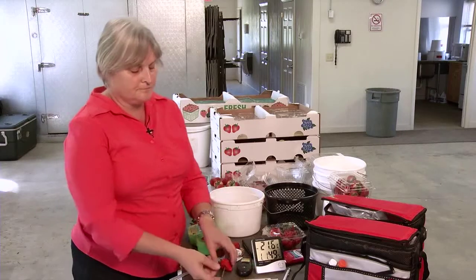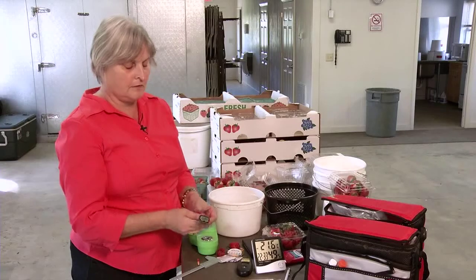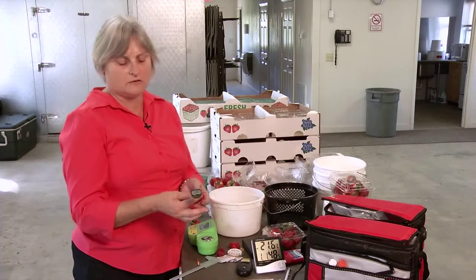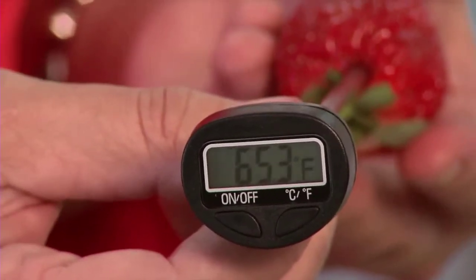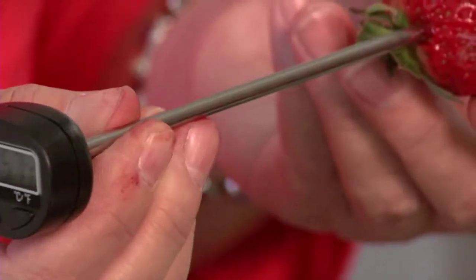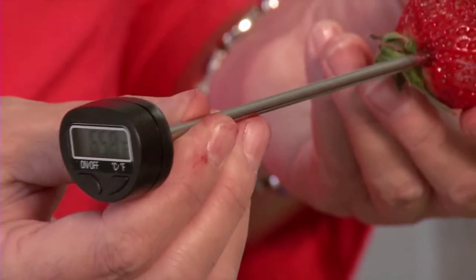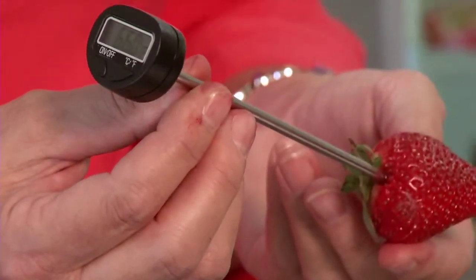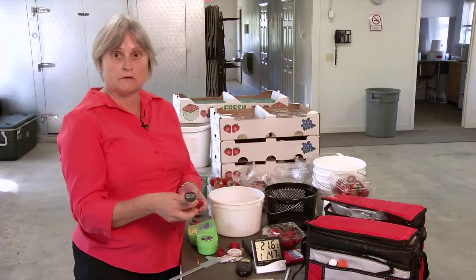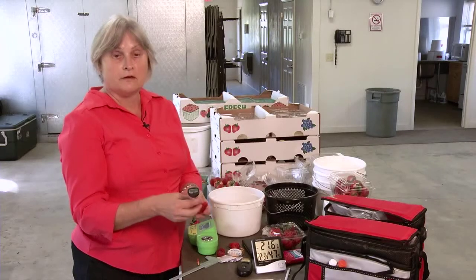Then this one is a simple food thermometer — this one came from Harbor Freight, anywhere from $3 to $10 depending on whether you get them on sale. What you usually have to do for food safety is have a definite sticking destructive-type temperature read. You simply stick this in and get a reading. This will give you the internal temperature of the berry, just like you were measuring the internal temperature of meat — but in this case it's a fruit. These are very nice to have. You can put them in your pocket, carry them around, and if you lose one it's not a big deal because it's pretty inexpensive.